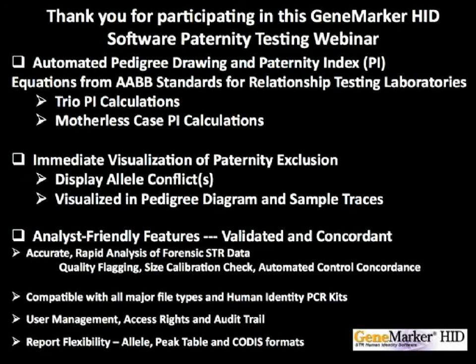GeneMarker HID is an analyst-friendly program which has been validated and concordant in many laboratories. The program has accurate, rapid analysis of forensic STR data, including quality flagging, size calibration checks, and automated control concordance. It is compatible with all major file types and human identity PCR kits. The user management provides access rights, control, and audit trail. The report flexibility includes allele reports, peak tables, and CODIS formats.